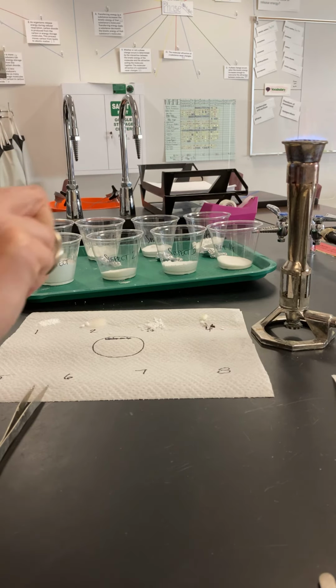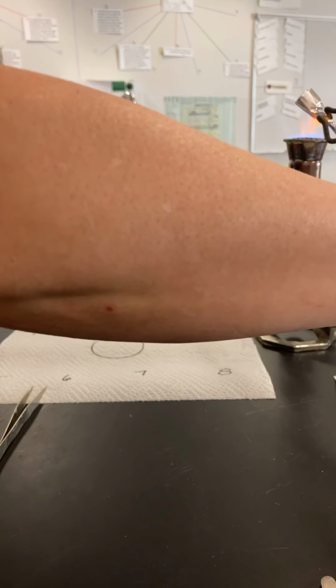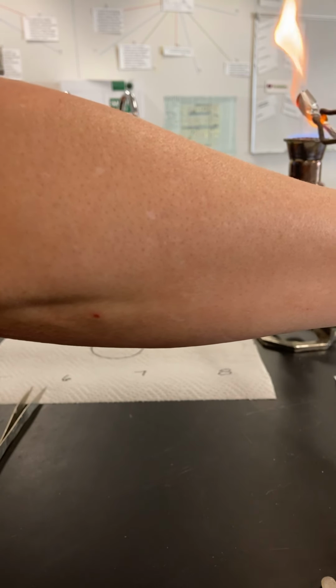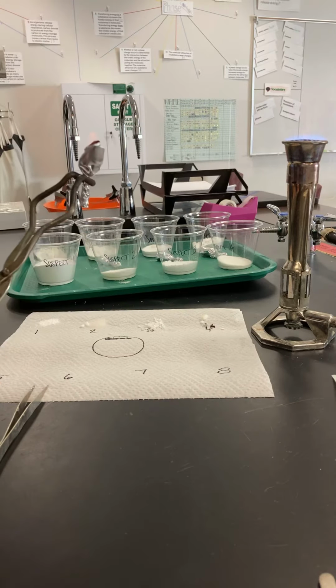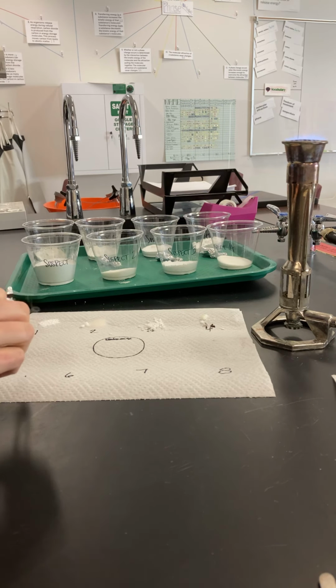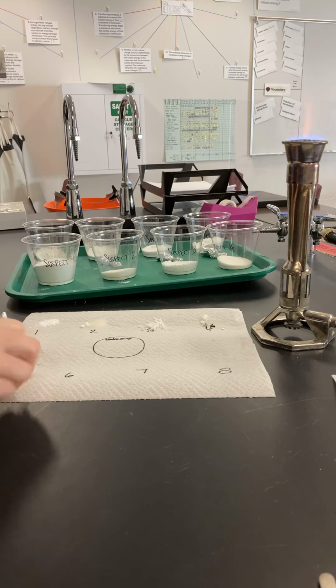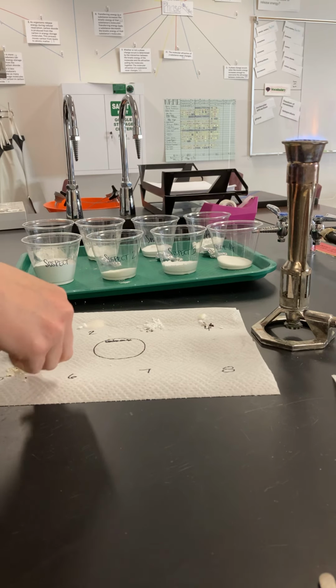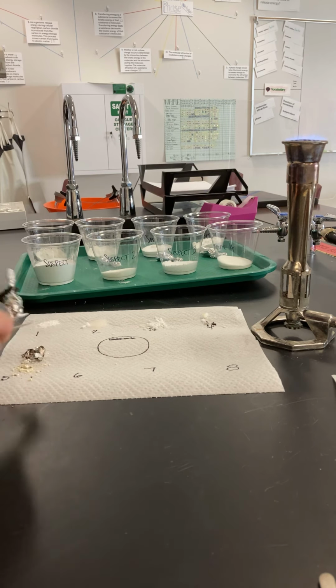All right, substance 5. 1, 2, 3, 4, 5. So within the 5, notice it started on fire. It also started to melt here as well. Let's see if I can open this up a little bit better for you guys. It definitely turned black. It's kind of crumbly. I'll leave just a little bit of that tin foil so you guys can see the black part of it. Okay, so that was substance 5.